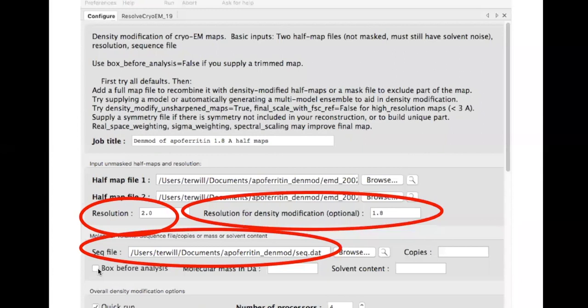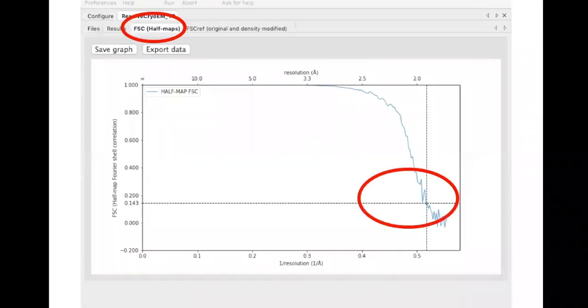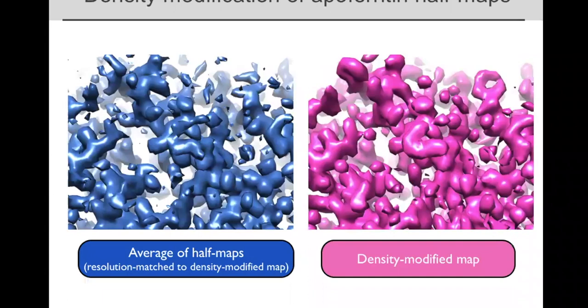I haven't done studies that are systematic about focused maps versus not focused maps. You could give it a try on a focused map and only look at the focused map part. It could be tricky because the program is assuming that the whole macromolecule region is somewhat constant in its density values, but if it's a focused map, that may be very untrue. So if you try that, let me know how it goes. I don't know what's going to be best with that. Any more questions on input maps?